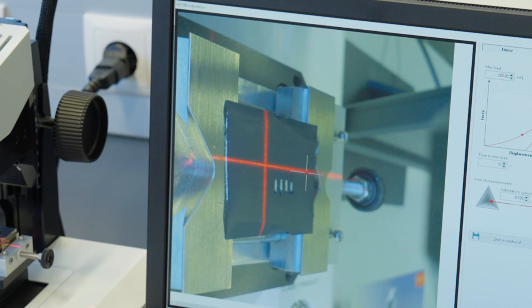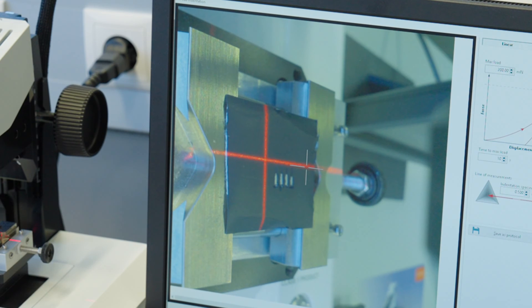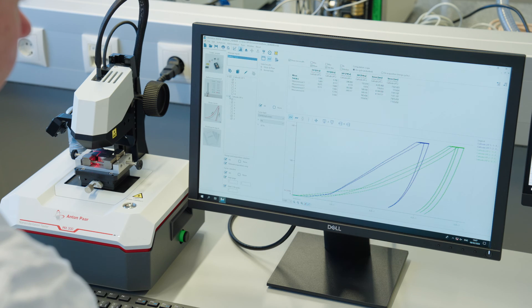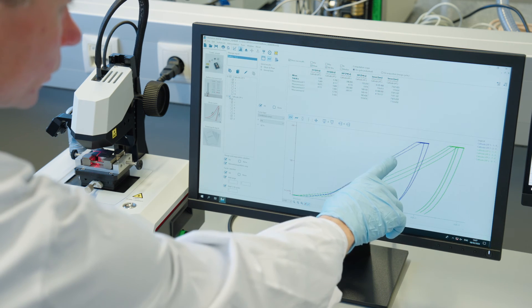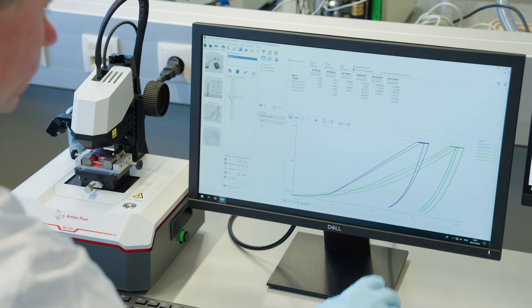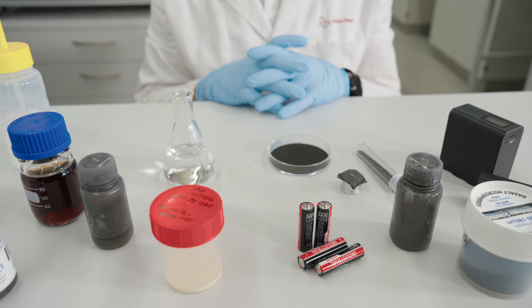The spot marked with the laser beam indicates the location of the first indentation. Once all indentations are completed, we can view the load-displacement curve for each indentation, or we can compare all of them in a simple statistical visualization. The statistical evaluation allows us to compare different electrode coatings, including comparison of the mechanical properties of coatings produced with different parameters and under different conditions.